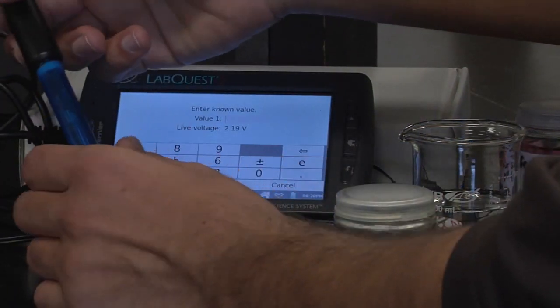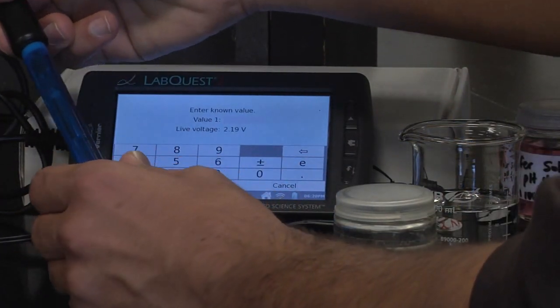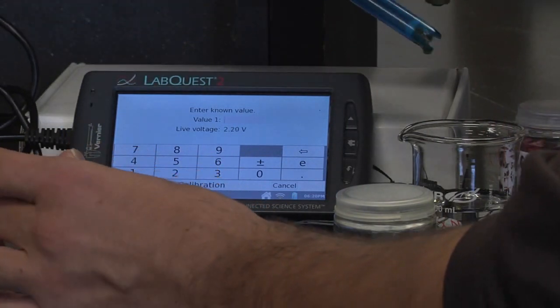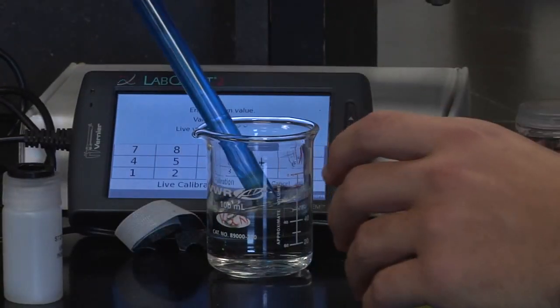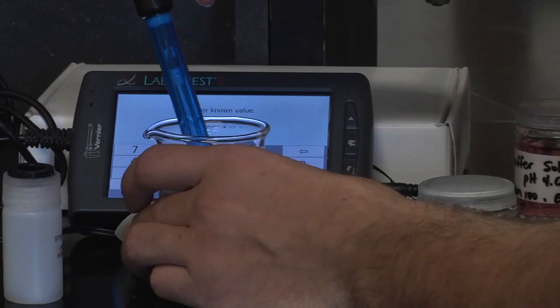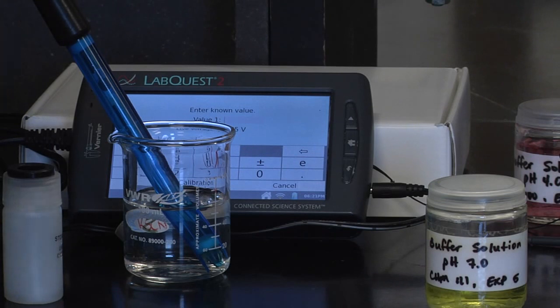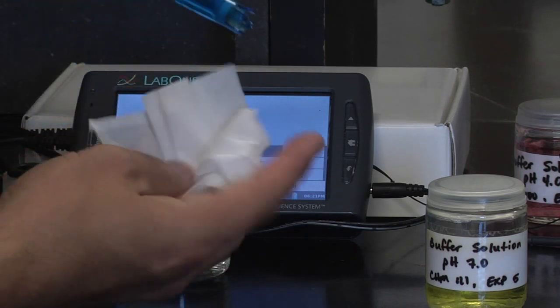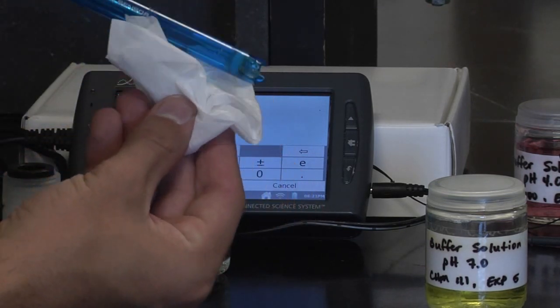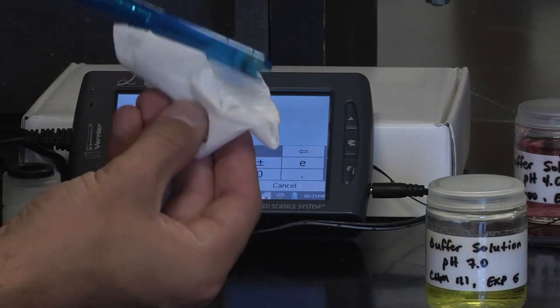We can now take our probe and rinse it in distilled water and dry it off with a kim wipe. Make sure to not smear the probe, as you might build a small electric charge on it. Just dab it dry.